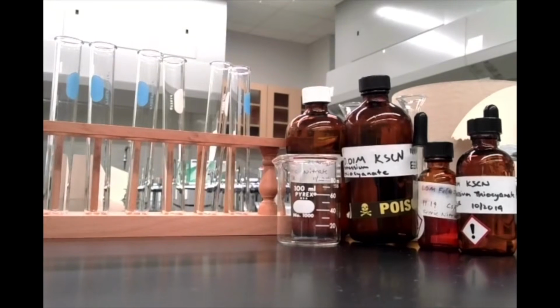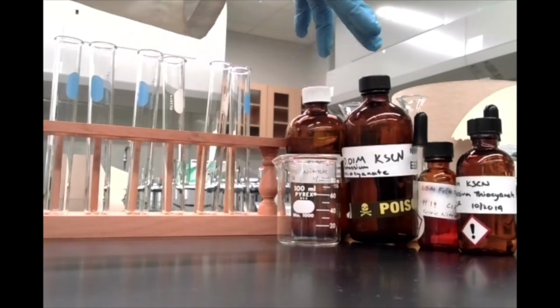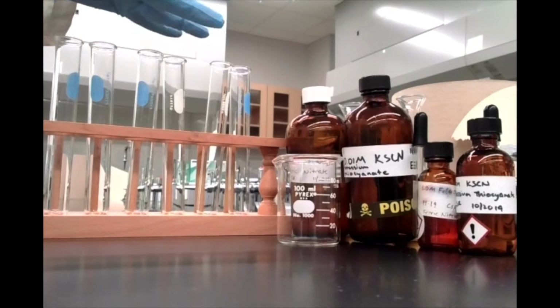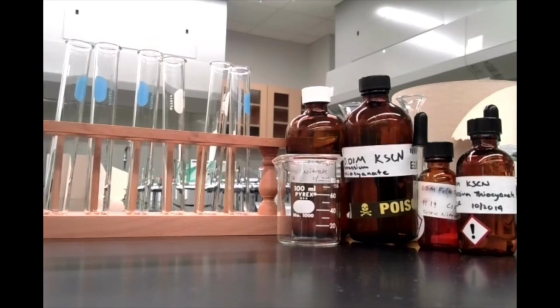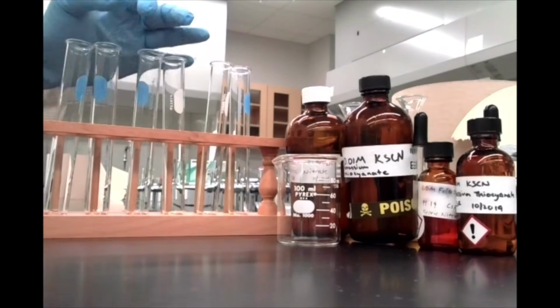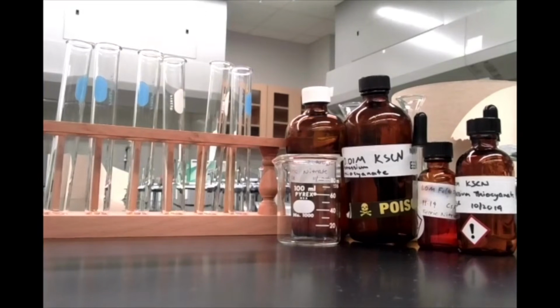So we're going to see Le Chatelier's principle by playing around with this equilibrium. We're going to make a mixture of these two compounds, and start off with 6 test tubes of that mixture. Now, one of these is going to be a reference. We'll just add water to it. But we're going to add various things to our other test tubes, or in the case of the last two test tubes, we're going to change their temperature. And we're going to see the effect of these different changes on the equilibrium.